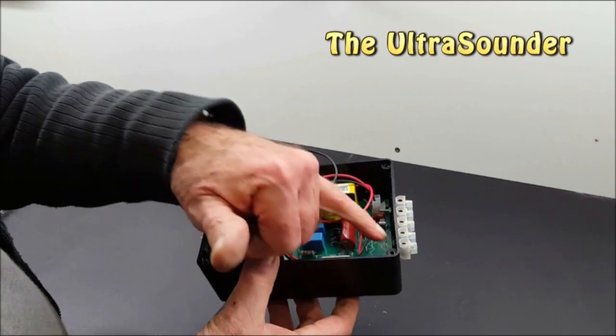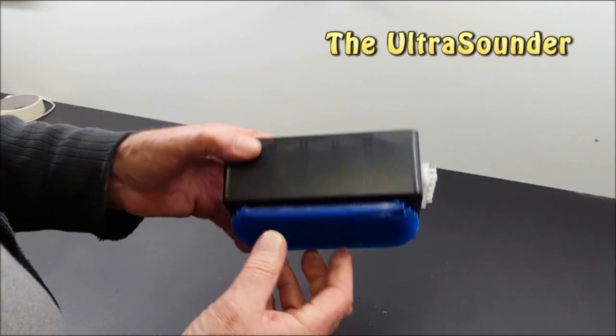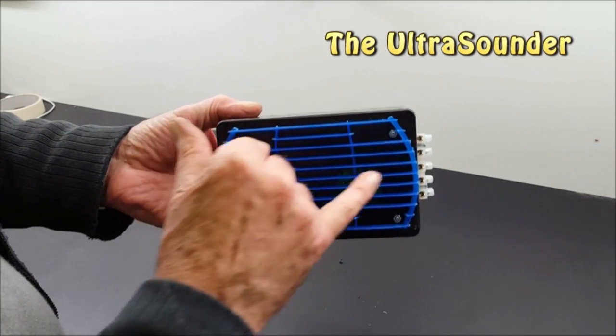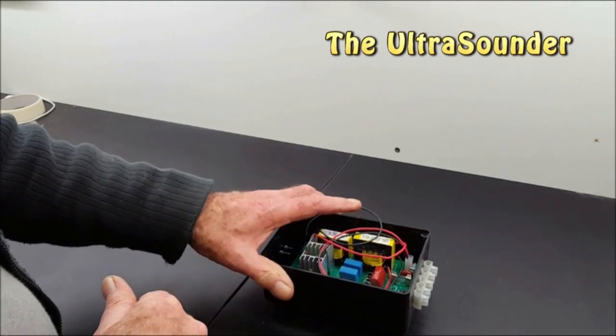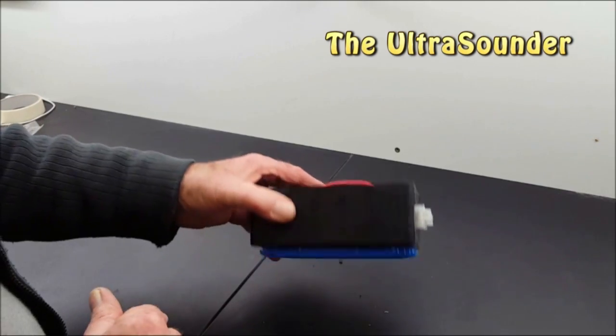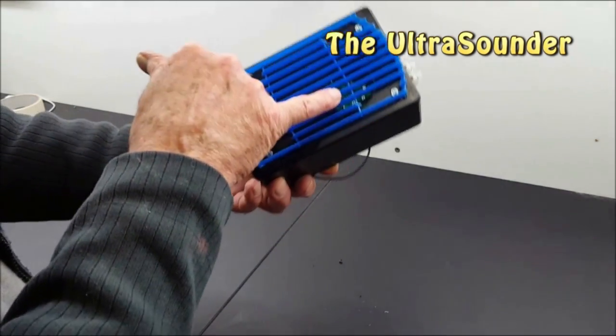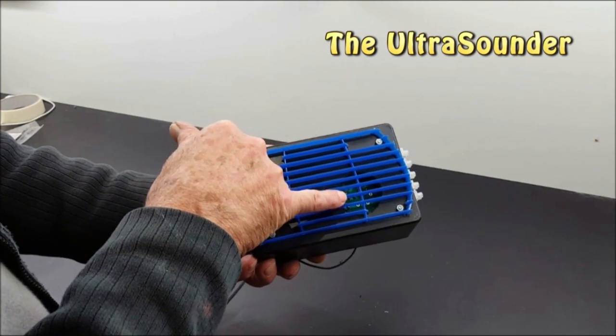If you look underneath, there's this which has two functions: it keeps it off the bench a little bit, which is good in case you spill anything on the bench - and I often do - but also through there I think you may be able to see there's a hole which allows air to flow out from inside the box.